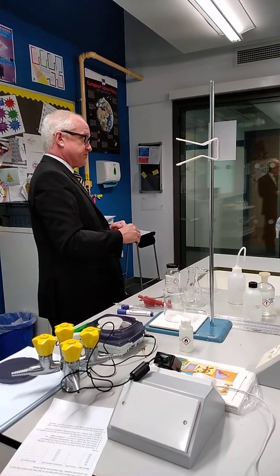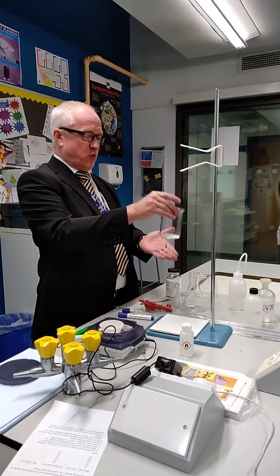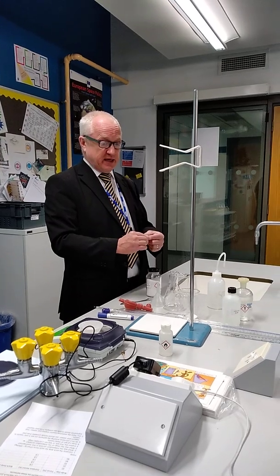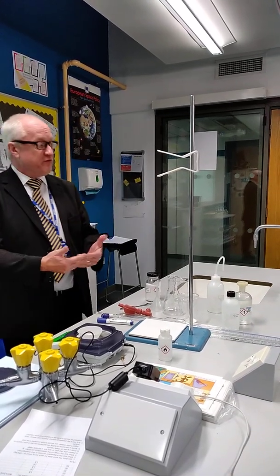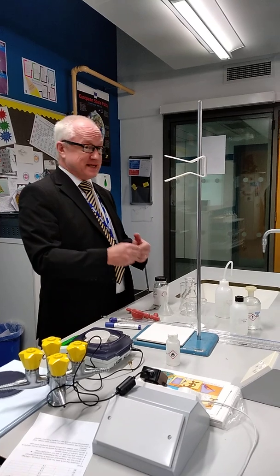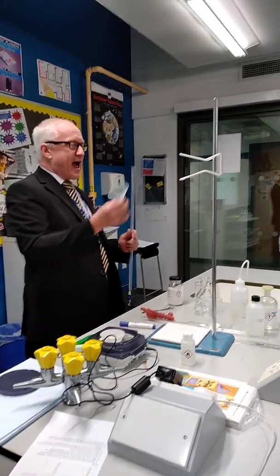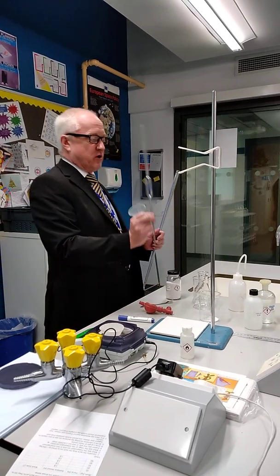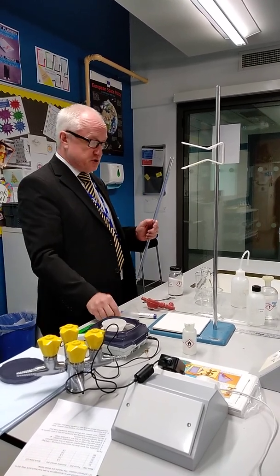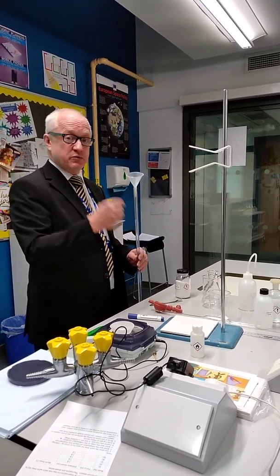We're doing a back titration. What that means is we're first going to dissolve this and react it with sulfuric acid. I need to add a known amount of sulfuric acid. If I add not enough, all of this will not react. So I've done a rough calculation and I'm going to be adding 100 cubic centimetres of acid into the beaker, but I need to add it accurately. The biggest pipette we've got is 25, so we're going to use a burette and add two burettefuls. We are not going to use a measuring cylinder because it is not accurate enough.